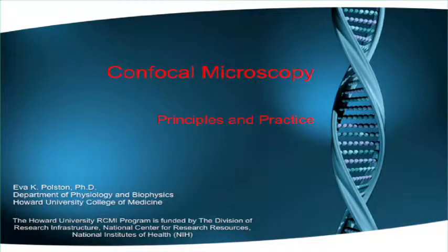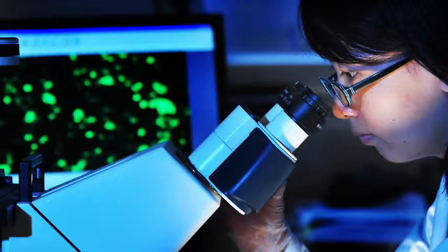And I administer the Confocal machine that is supported through the RCMI program. I'm just going to very briefly introduce you to the principles of confocal microscopy and what you can do with our machines. And then this afternoon, if any of you have further interest, you're welcome to swing by the Confocal lab. It's housed in the neurobiology core facilities on the second floor of the Adams building, and I'm happy to show you in more detail how it works and what we do.